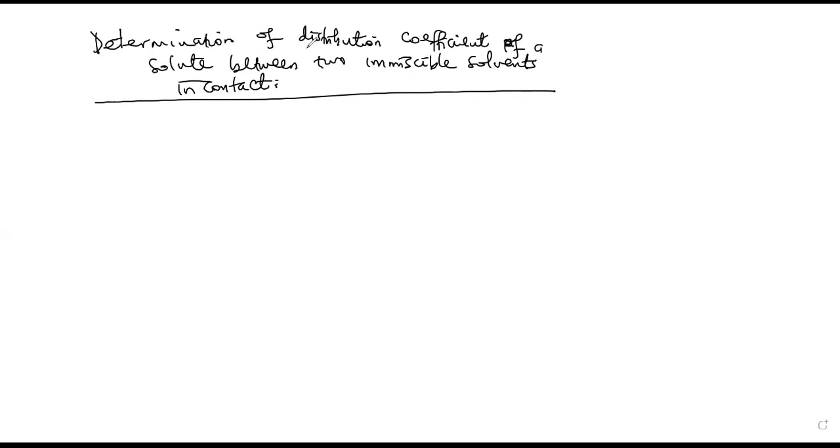But now we want to look at how we determine Kd, or the partition coefficient, experimentally. Now, in this case, you need to know that we get a known mass of a solute and dissolve it in known volumes of two immiscible solvents. You need to understand what the limitations are, because these limitations are going to be guiding us throughout.